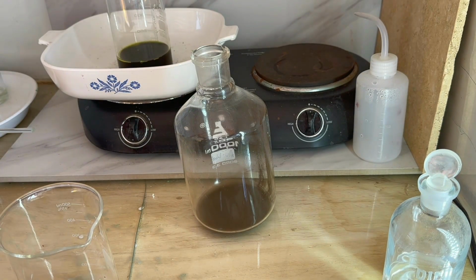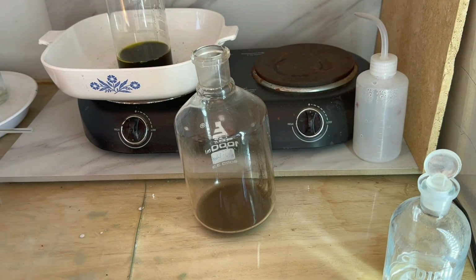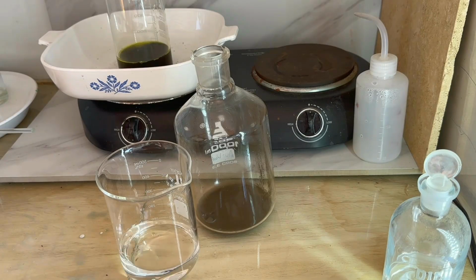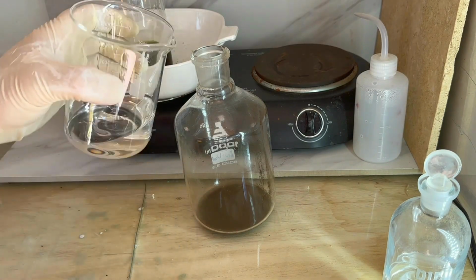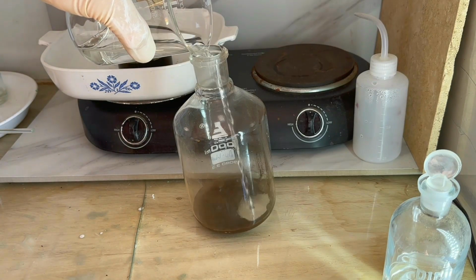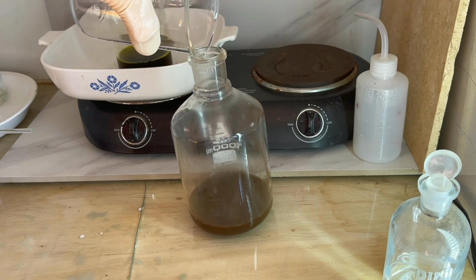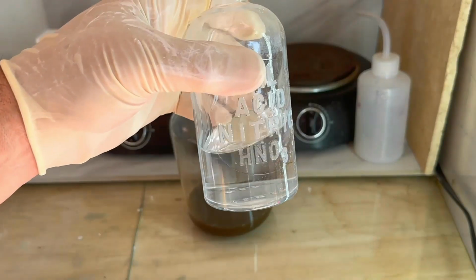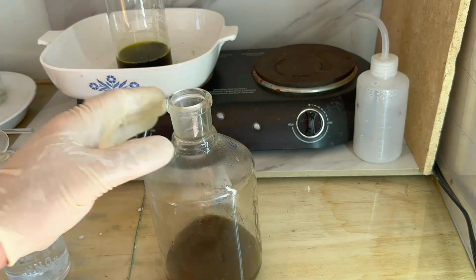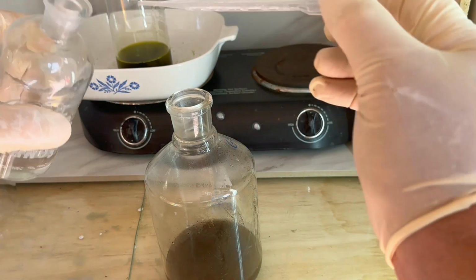So I'll set this over here. Again, going to put some muriatic acid into this beaker. The mouth of the little flask I have there is a little too small to reliably get the muriatic into it. So instead of having to wipe up a spill, I'll just put it in the beaker. Going to add some of that in. Go ahead and grab our nitric here. We'll add probably 3 or 4 milliliters again. I don't expect there to be a lot in here, so I don't want to overshoot it too much. But we'll start there and then see where that takes us.